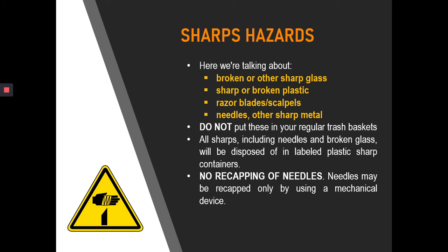All sharps must be disposed in labeled plastic sharps containers. We have here no recapping of needles, because needles may be recapped only by using a mechanical device. The reason for this is that when you try to recap a needle, there is always a possibility of getting accidental punctures, especially if you are not being careful. So it only makes sense that when you try to discard a sharps, it should be done by a mechanical device.